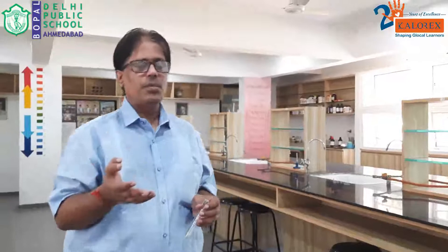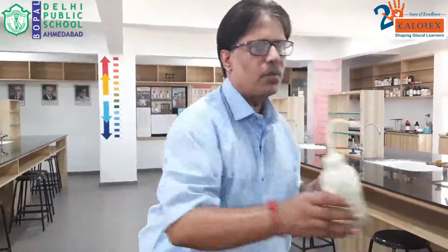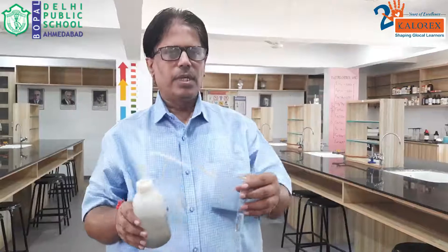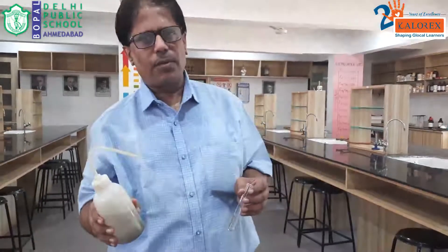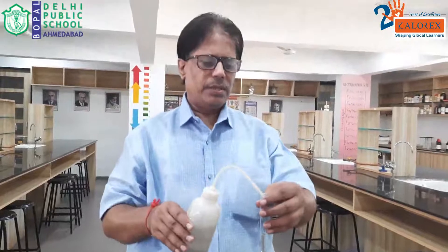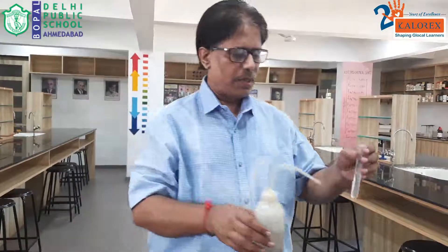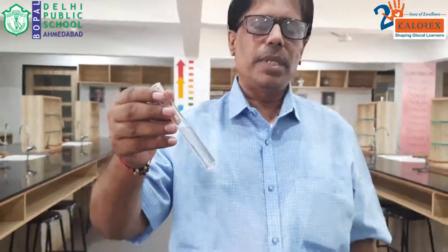After Group 1, let's go to Group 2. Group 2 uses dilute HCl and H₂S. Before H₂S, we add HCl — this is based on the common ion effect principle of salt analysis. Group 1 was absent. We added HCl and now we are adding H₂S. We have prepared a saturated solution of H₂S as a supplement. Adding H₂S water — no precipitation, no observation. So Group 2 is also absent.